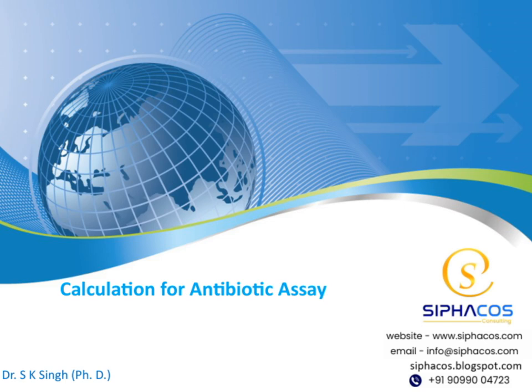Today, we will be discussing an important topic in pharmaceutical analysis: calculation for antibiotic assay. This is a crucial method used to determine the potency of antibiotics in various formulations. Over the course of this presentation, I will guide you through the fundamental concepts, the step-by-step calculation procedures, and some practical examples. So, without further ado, let's get started and explore this essential aspect of antibiotic testing.